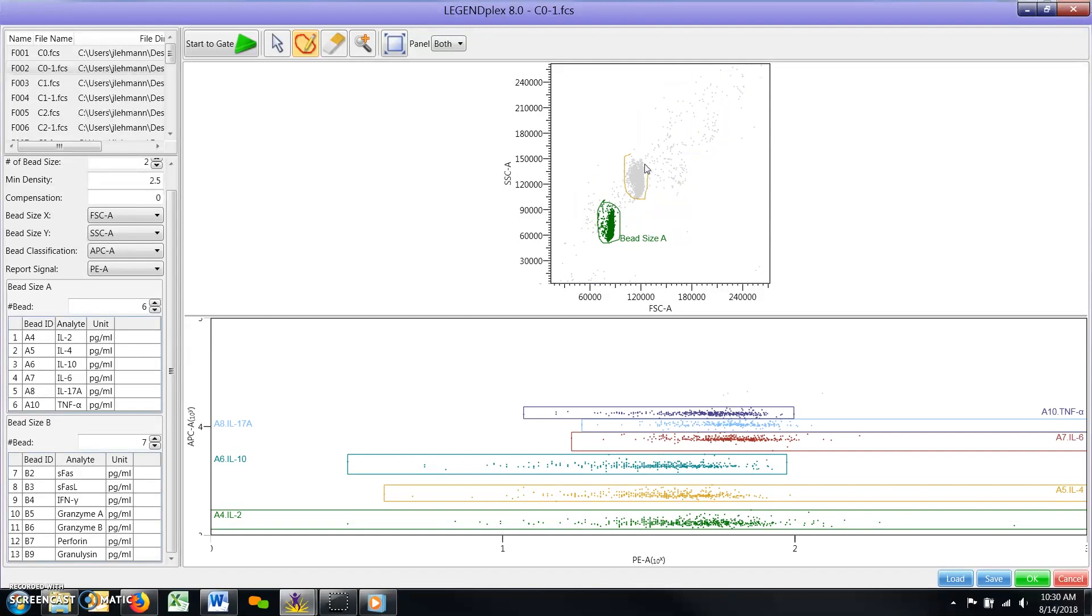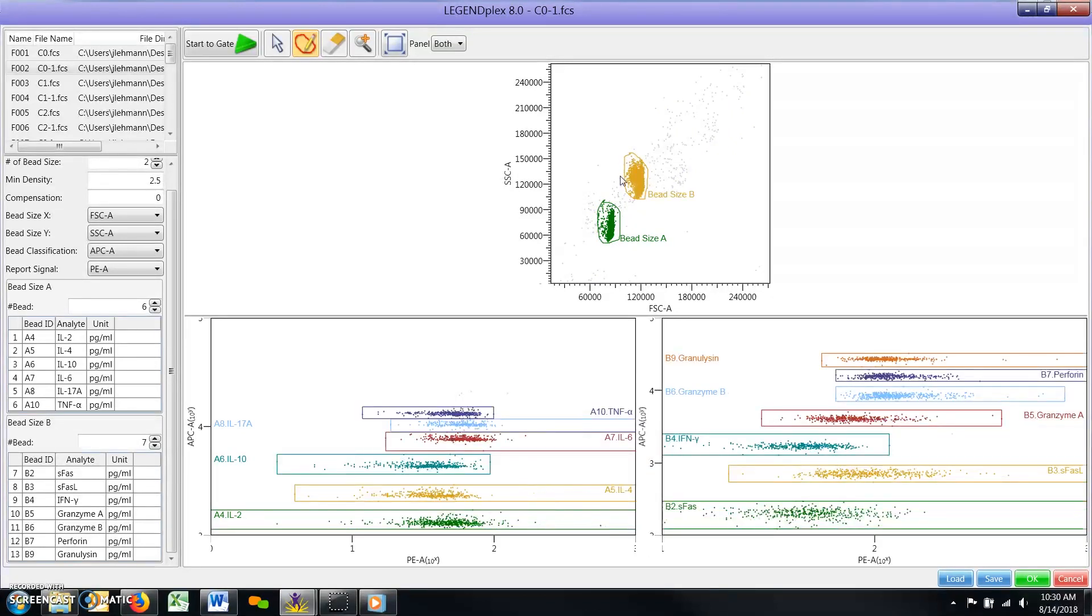If you make a mistake or would like to adjust the fluorescent scatter plot gates that the software has just applied, please select the eraser icon from the toolbar.